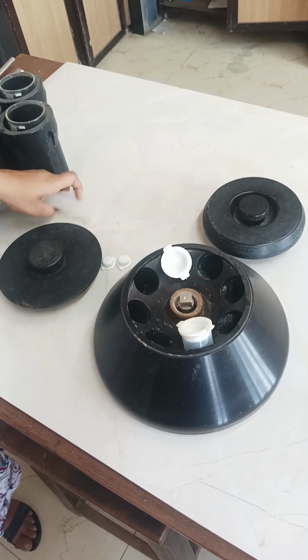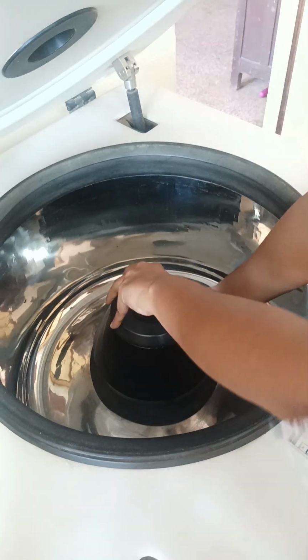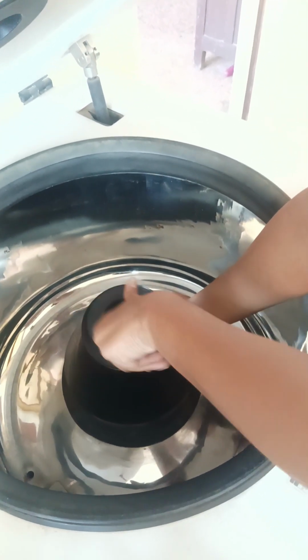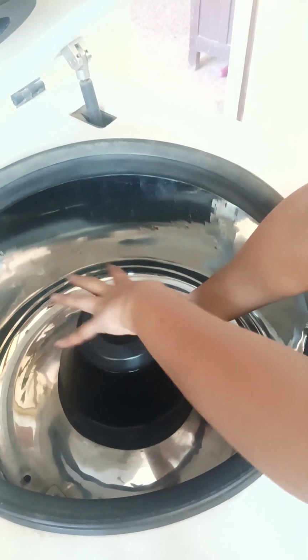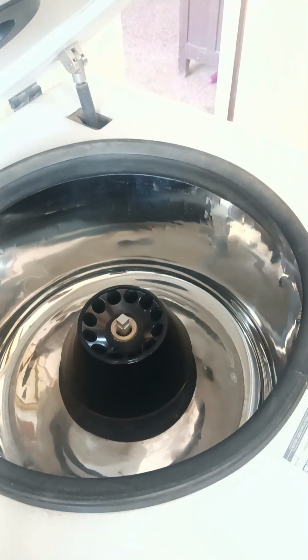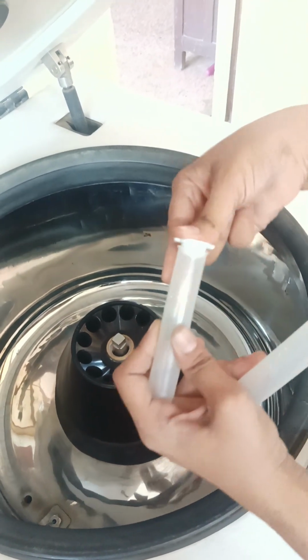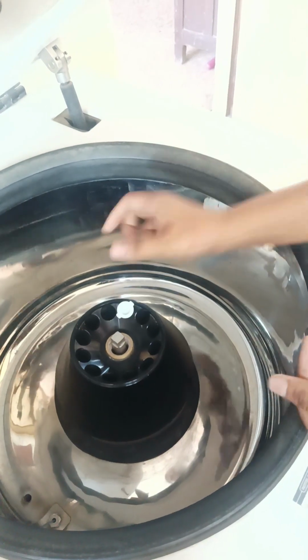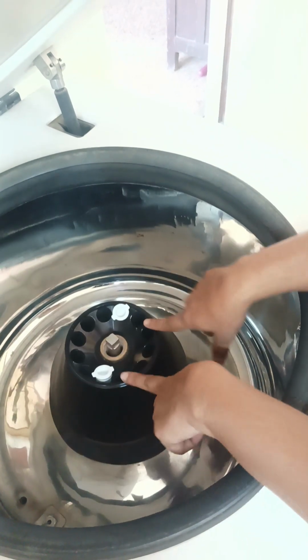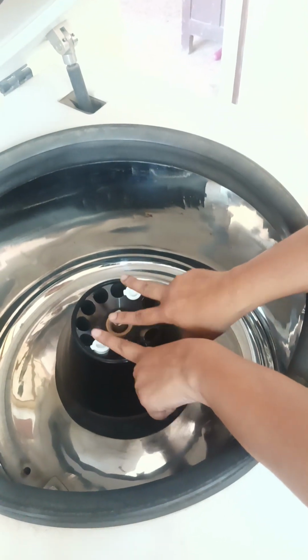Another type of rotor which we have is this particular rotor, which takes tubes of 15 ml capacity. It has a lid, and in this manner the rotor has to be fixed. Now I am opening this rotor. These tubes of 15 ml capacity will go into it. You have to close the lid properly. You put the tubes into it, and like this you have to put them in front of each other. Make sure that you balance it with an equal volume of sample.